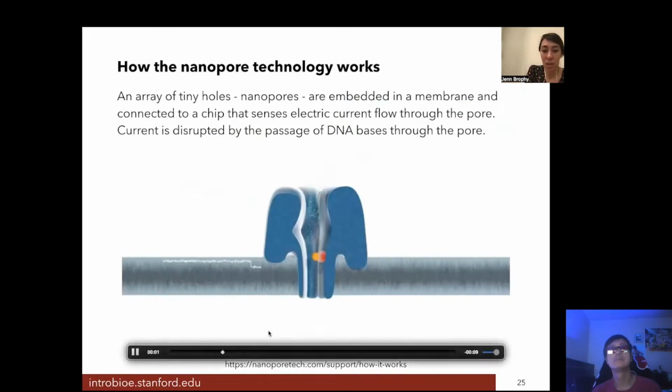And so here's an animation of this kind of thing occurring. In this case, it's modeling the DNA bases of different kinds as these orange balls of different sizes. And you can see the current passing through on the left. The current's passing through at a high level until that first ball occurs and it dips. The second ball, which blocks more of the current, gives a bigger drop. And when it's removed, it returns to the baseline. And so each nucleotide interferes with the passage of ions through this pore differently and gives a unique signature. So you can sequence the DNA as it goes through.